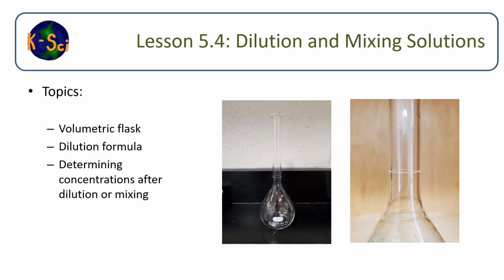Hello there. In this lesson, we're going to learn about dilution and mixing solutions. When you are making up a solution, a piece of glassware that's really useful is a volumetric flask.